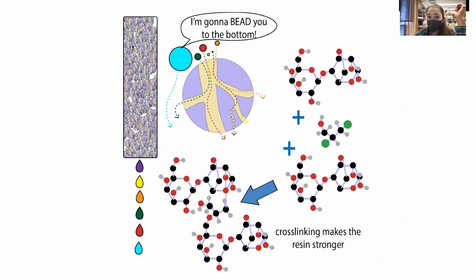And these beads are often made of agarose or similar modified forms of agarose, or dextran, various things. But agarose is really good for this because it is neutral, which is one of the reasons why it's good for the DNA gels. But we also don't want it to melt, and we don't want it to squish, all of these things. And so it also has modified forms with cross-linkers that help cross-link these chains together, as opposed to just being knit together. So, cool stuff. And there are a lot of places you'll see agarose if you are doing biochemistry.